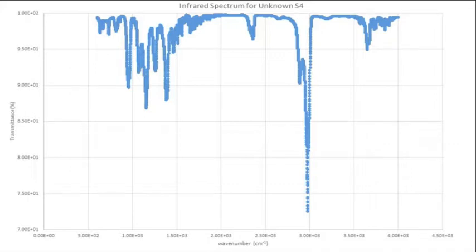Anthracene has a structure that contains cyclic alkenes, but a peak was present at 2,980 inverse centimeters, which indicates an alkane. This shows that there was some error in the experiment. The unknown is still most likely anthracene, but the peak was shifted to a smaller wave number because an outside factor interfered with the sample.